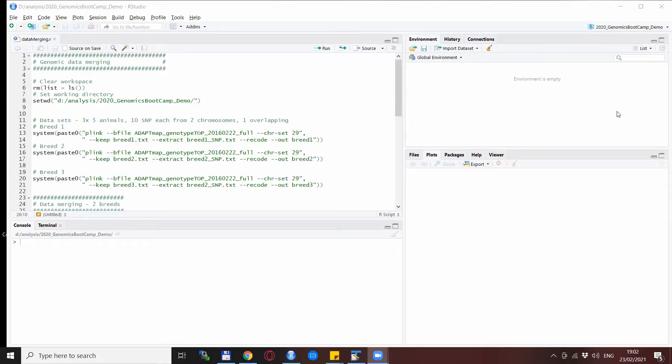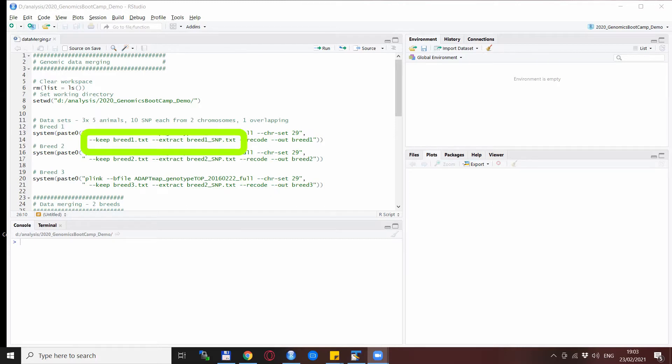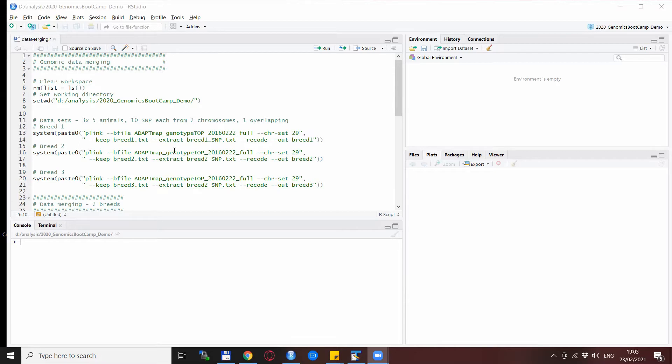So here we are in R to demonstrate the merging process. Before doing that we will generate datasets. We will generate three datasets for three breeds with the keep and extract statements. Technically we can merge both the classical ped and map files and their binary versions, but we will go for the classical ped and map files because here we can see actually the data itself and we can also see the genotypes.